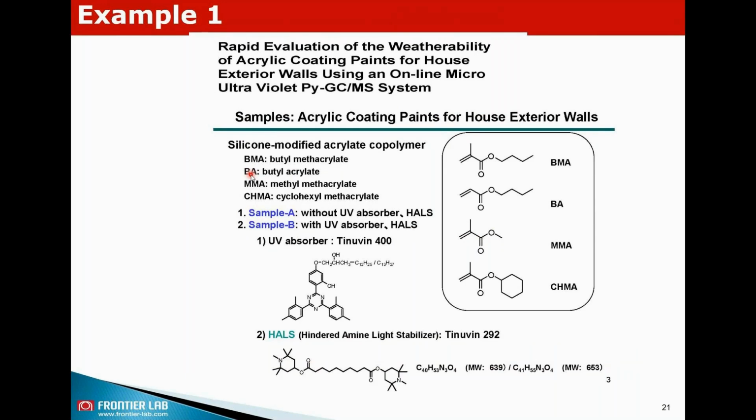So I have three types of examples to really demonstrate that. The first example is we can study the evaluation of the weatherability of the acrylic coating of paints. Okay, as you know, when we are buying exterior wall paints, we all want a longer lifespan because we do not want to spend money every other year.